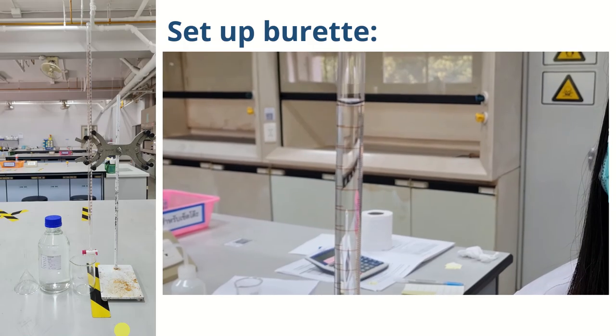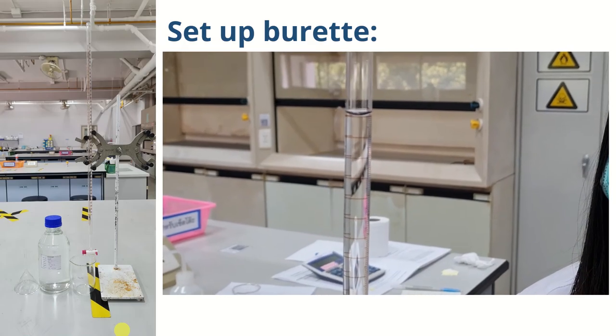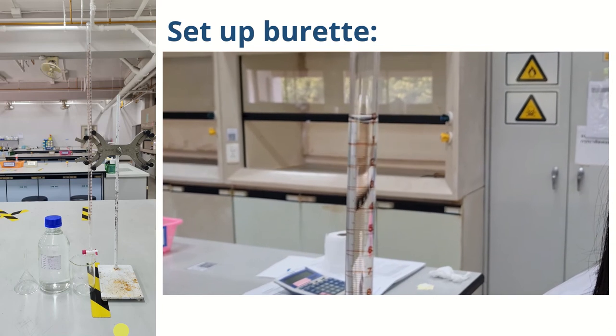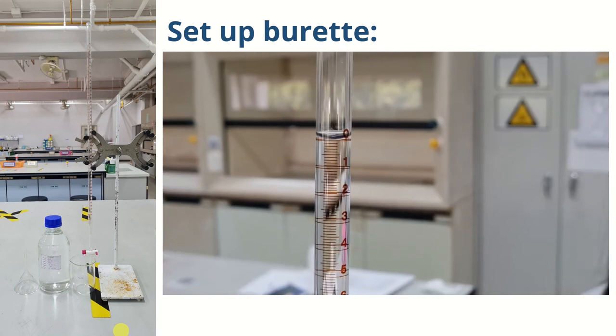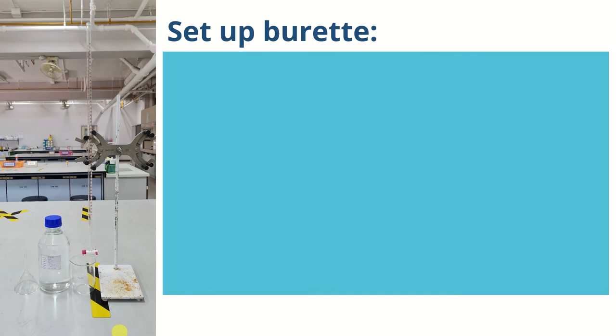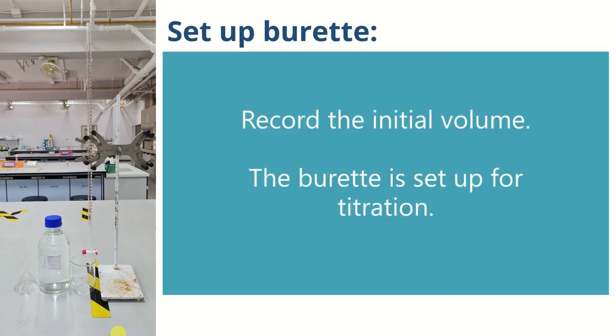See the meniscus, the bottom of the liquid. Here you are. This is the 0.0. Record this initial volume. The burette is set up for titration.